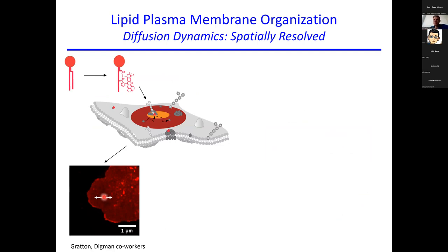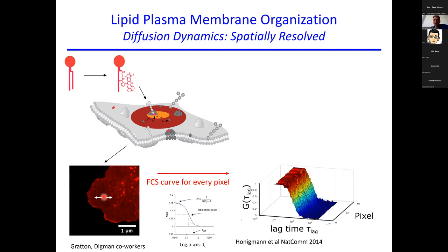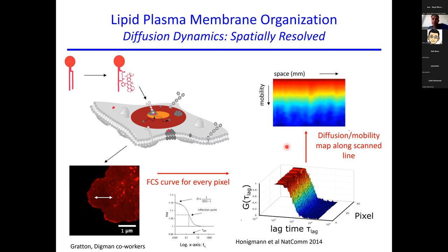And what do you get for each pixel along this line? Because you scan the same line thousands of times, along each pixel, what do you get? A temporally fluctuating signal. And this temporal fluctuating signal, you can correlate, and then you get a decaying curve for each point, for each pixel along this line. And we can see this decaying curve, we can color it from red to blue, and we can look at it from above. So we have this decaying curve from red to blue, red to blue. And most importantly, we look at the decay time. So we look in the yellowish area. And if we have, for example, a peak towards longer times, lag times, then these are areas where the diffusion slowed down. So that's why I named it mobility.